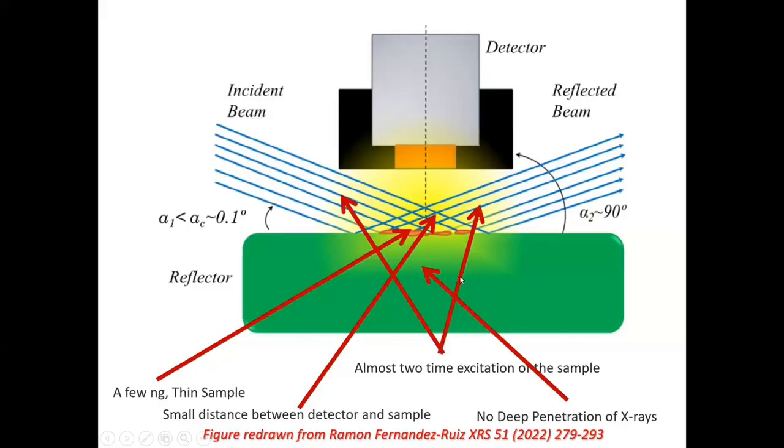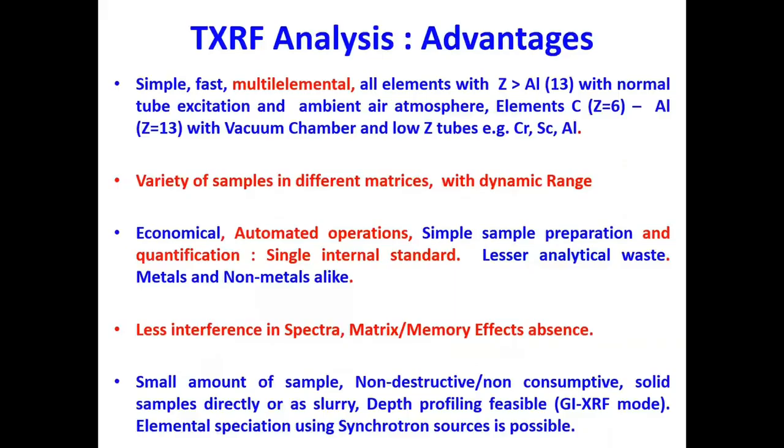Because of these advantages, total reflection X-ray fluorescence analysis has been applied to those areas also where normal conventional trace elemental analysis techniques do not find much application. So I will give some examples of those areas and try to explain how we can make TXRF a technique which can be used in a better way and by more laboratories. Here I have tried to summarize the TXRF advantages.